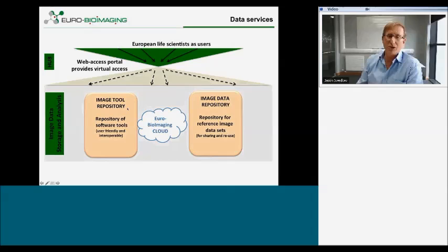The one I won't talk about today is the tool repository. This is a resource that European scientists could access, identify the tools, the software tools, the analytic packages, and so on that are appropriate to use for their imaging problems.